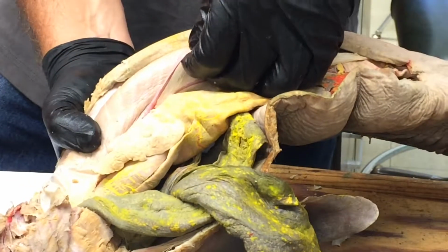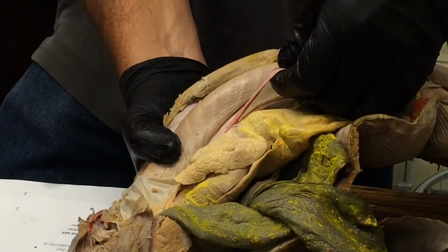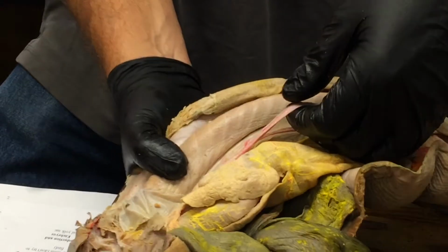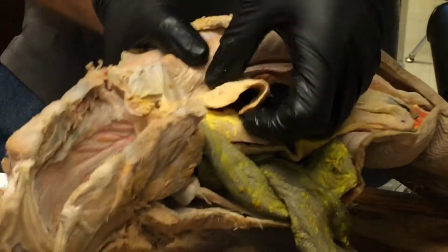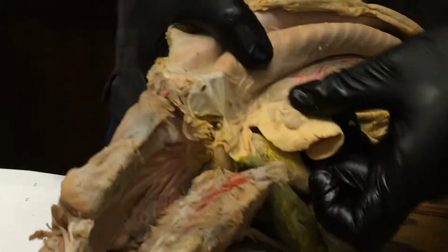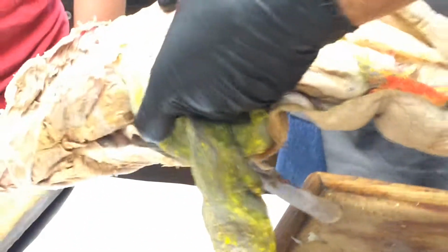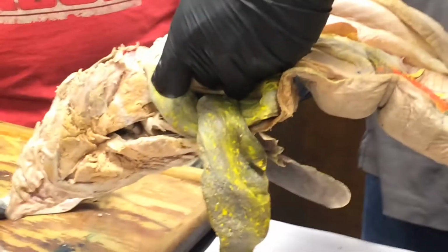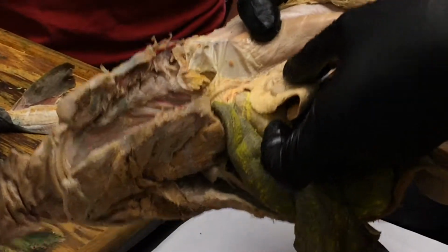Okay. And it's connected by a mesentery to the body wall, and that mesentery is called the mesotubarium. There's a swollen region of the oviduct that's right about there. You see how it's a little bit bigger there by my thumb? And that's the shell gland where the membranes of the egg are put on, and that's called, more officially, the nidamental gland. Okay, so that's right there.